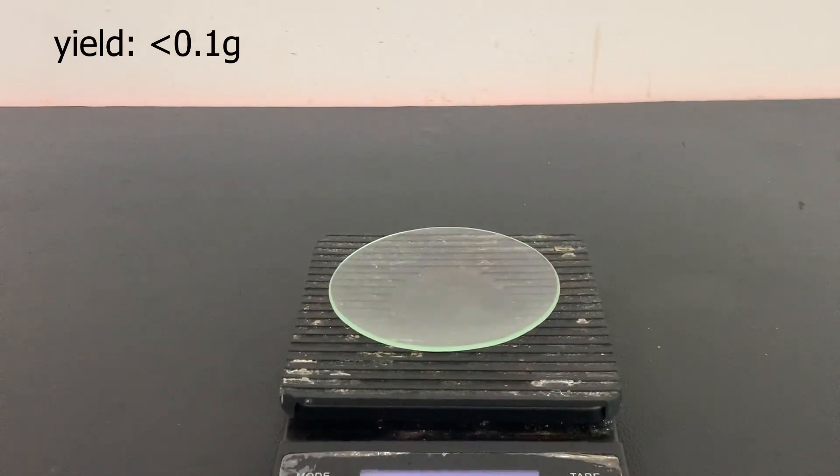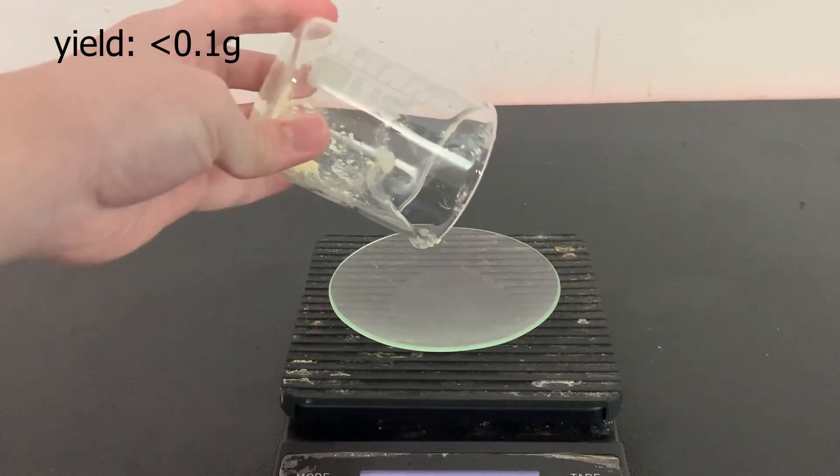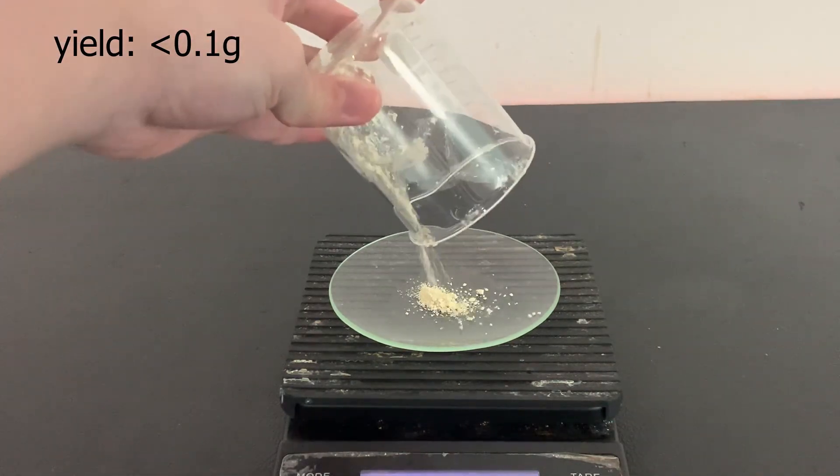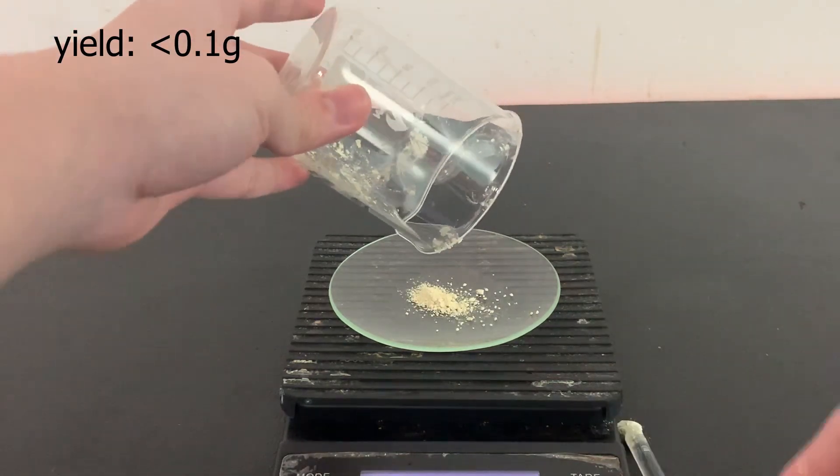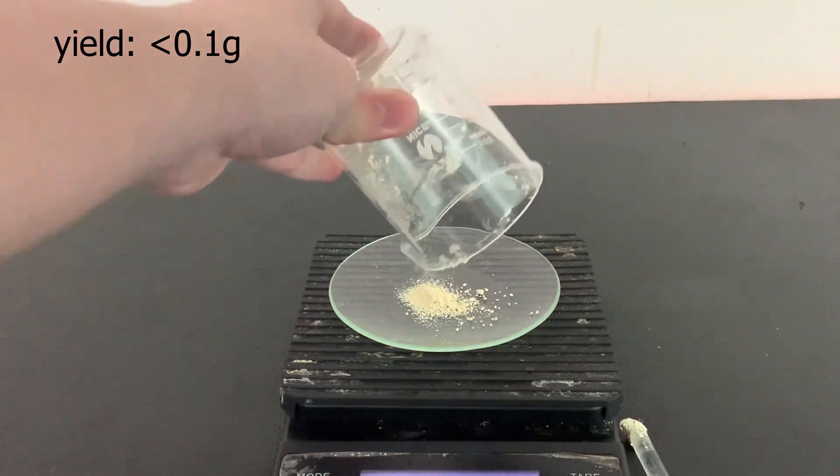I then measured the yield of the luminol I was able to produce. It came to be lower than 0.1 grams as my scale wasn't able to read it. The low yield probably came from me not refluxing the reaction long enough.